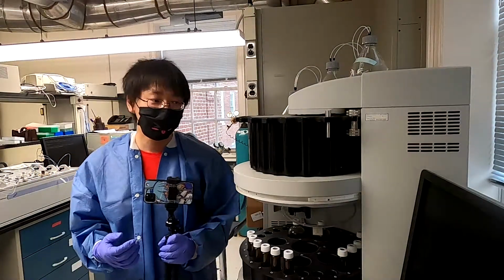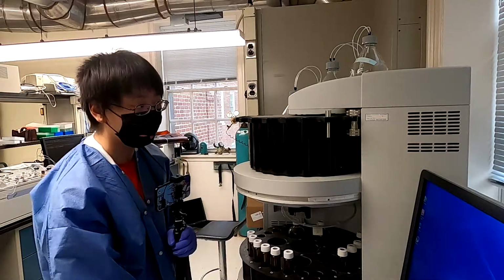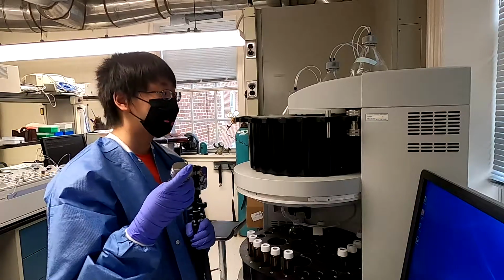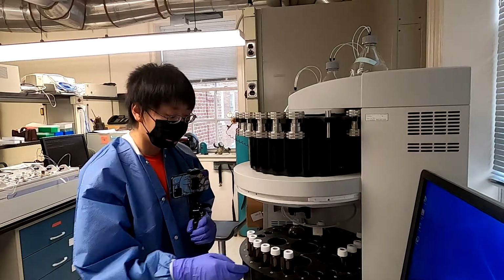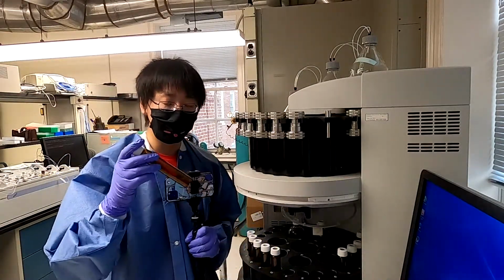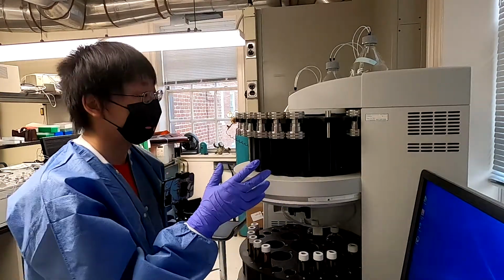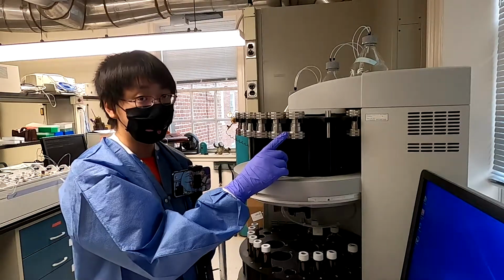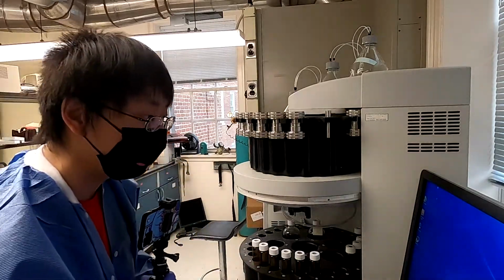And so this is the ASE, which is accelerated solvent extraction. So first we need to put the columns into this device, and then for the corresponding position, we have these ASE vials to collect the extract. And this ASE will extract the DDT in each of the columns and then send the extract into the vials here. So now let's run the ASE.